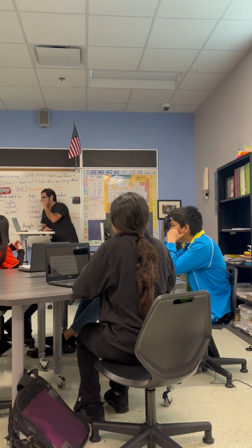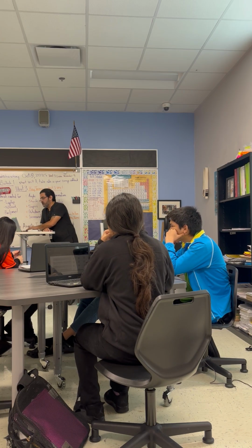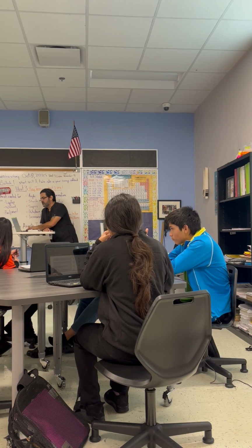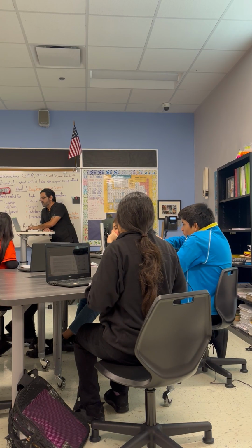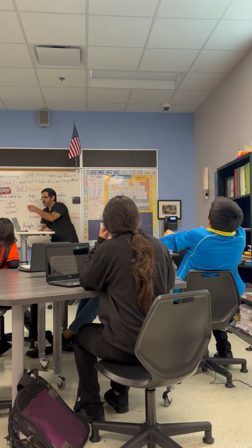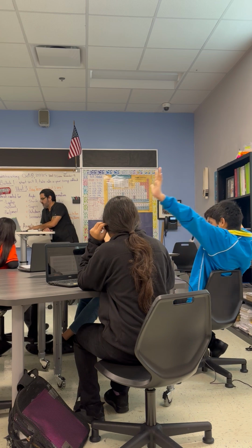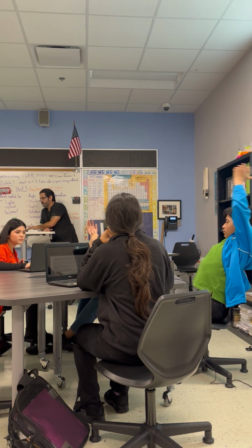But the gloves, the lab coats, the goggles, we have those, so we need to know how to use them properly in our class. And like always, you maintain a clean and organized workspace. That's why the school provides us with these wipes. They provide us with spray bottles to clean our surfaces so that we can prevent pathogens from spreading.